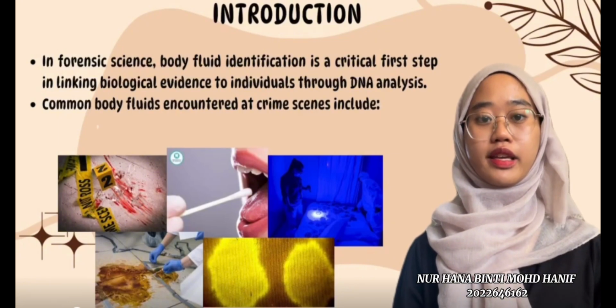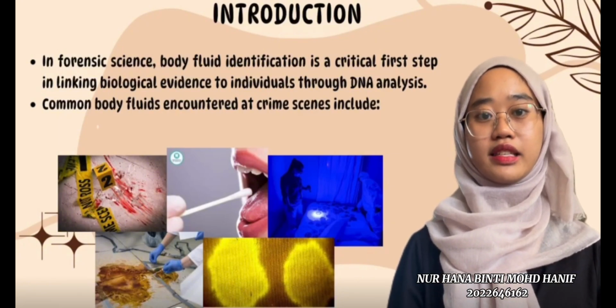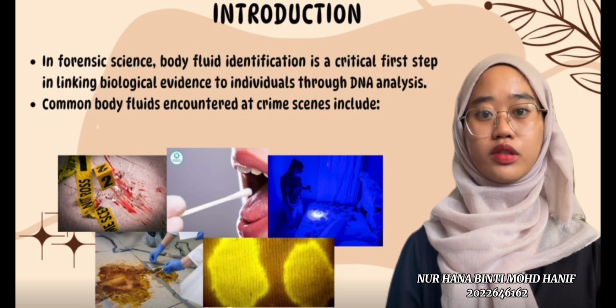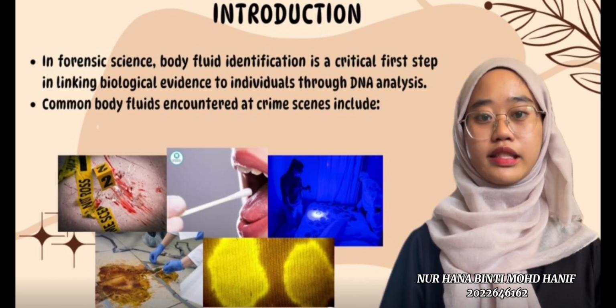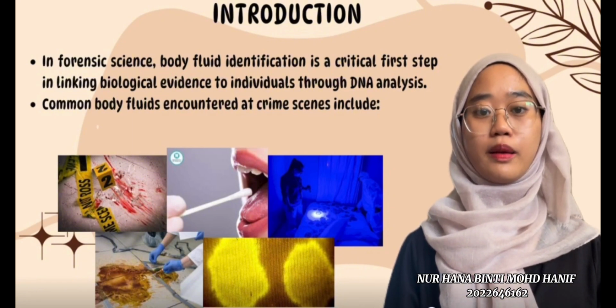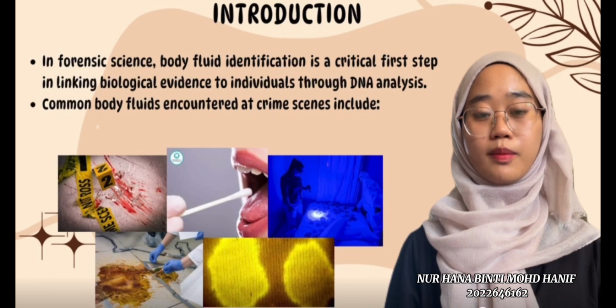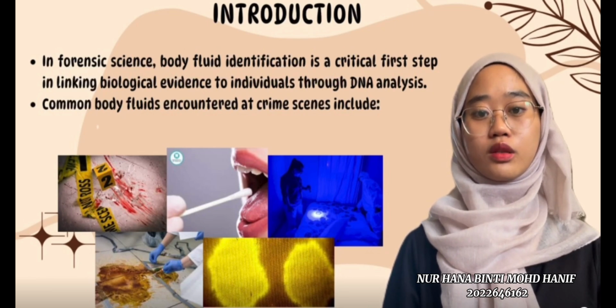Identification of biological fluids at crime scenes is a crucial step in forensic investigations as it can significantly influence the trajectory and outcome of a case. Among the common biological fluids such as blood, saliva, semen, sweat and vaginal fluid, urine has historically been overlooked in many universal detection methods despite its relevance in cases involving assaults or sexual crime.